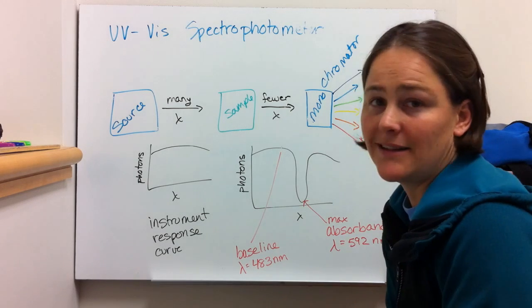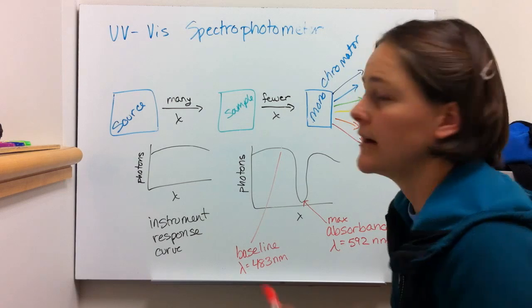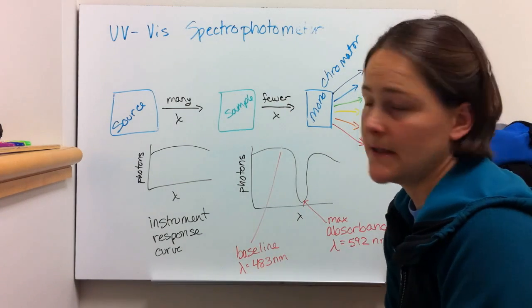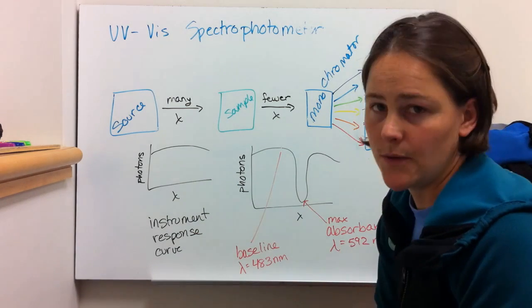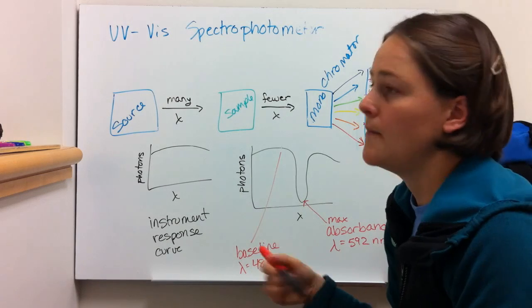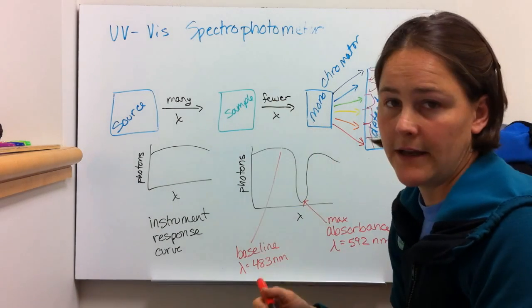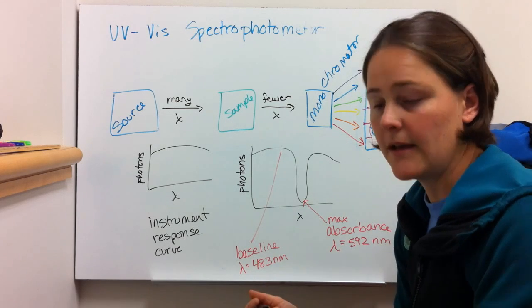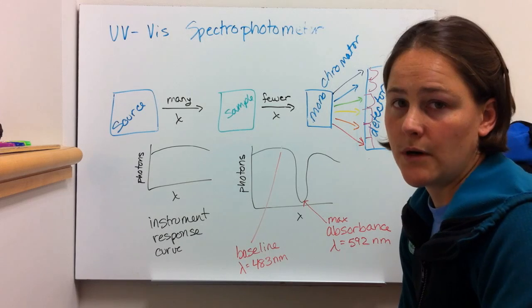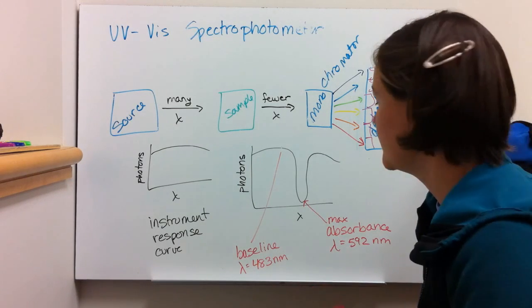What we talked about is a little bit nebulous, and I'd like to make it more concrete by talking about an actual experiment that you're going to be doing in Lab 2. That is using a UV-Vis spectrometer. I'm not going to go into a whole lot of detail right now, but essentially you have a source, which is basically a white light, many wavelengths coming in. It interacts with the sample, and then you have fewer photons at fewer wavelengths coming out of the sample. Then you use a monochromator to disperse it into its component wavelengths, and the detector detects at a bunch of different wavelengths.